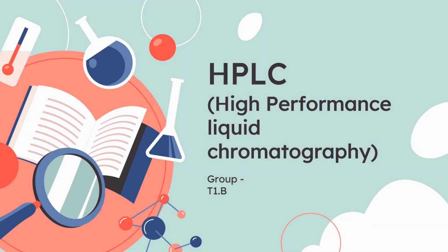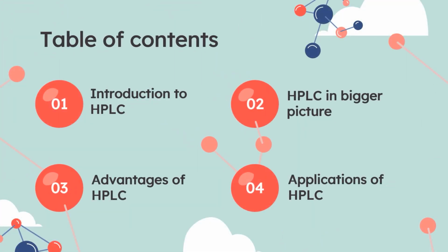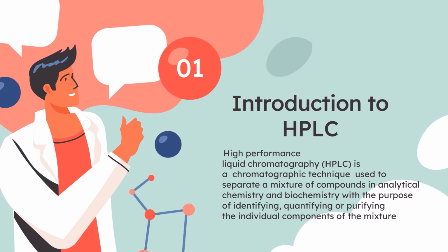The topic of our presentation is HPLC, High Performance Liquid Chromatography or High Pressure Liquid Chromatography. HPLC is a chromatographic technique used to separate a mixture of components in analytical chemistry and biochemistry with the purpose of identifying, quantifying or purifying the individual components of the mixture.